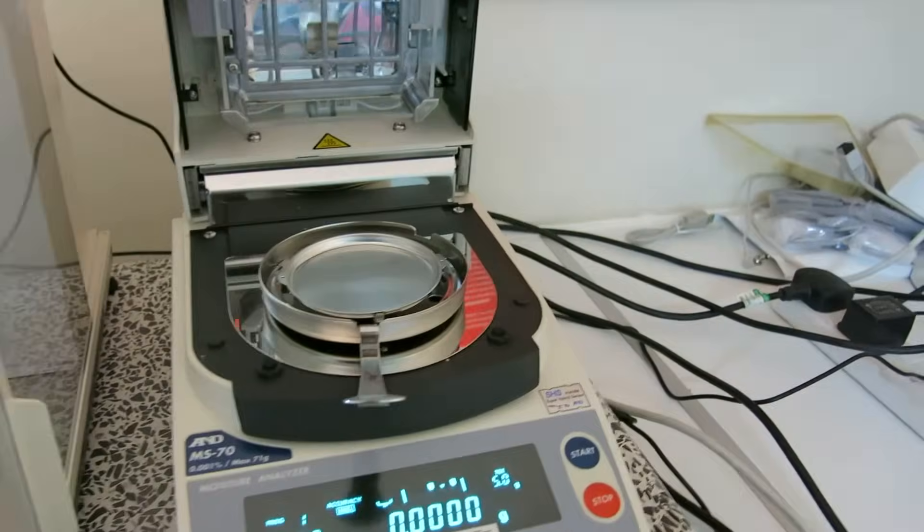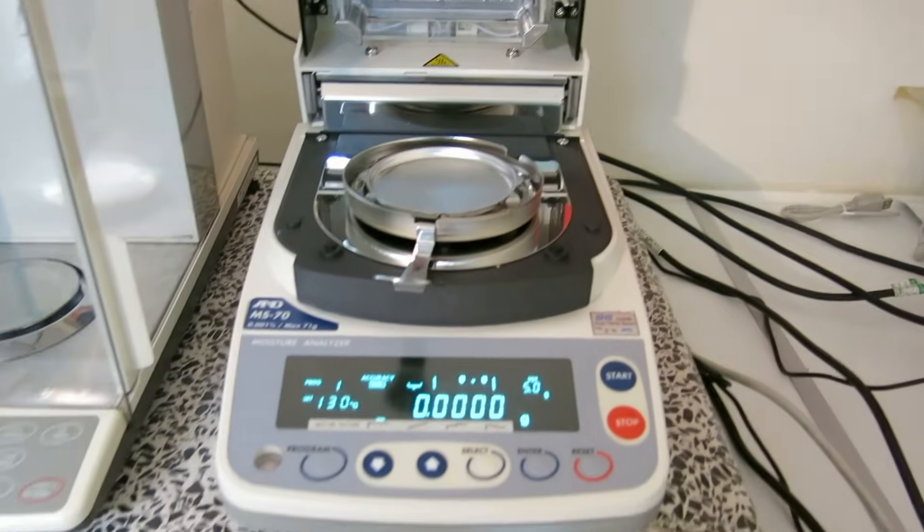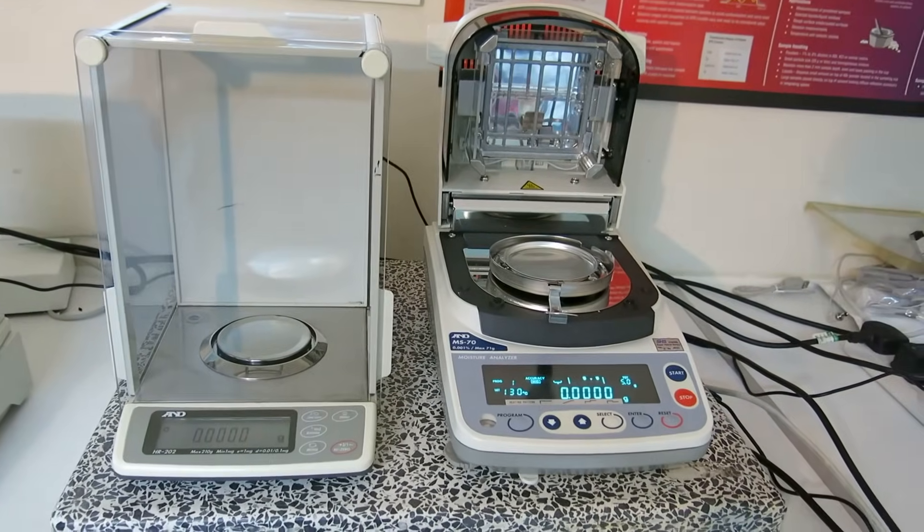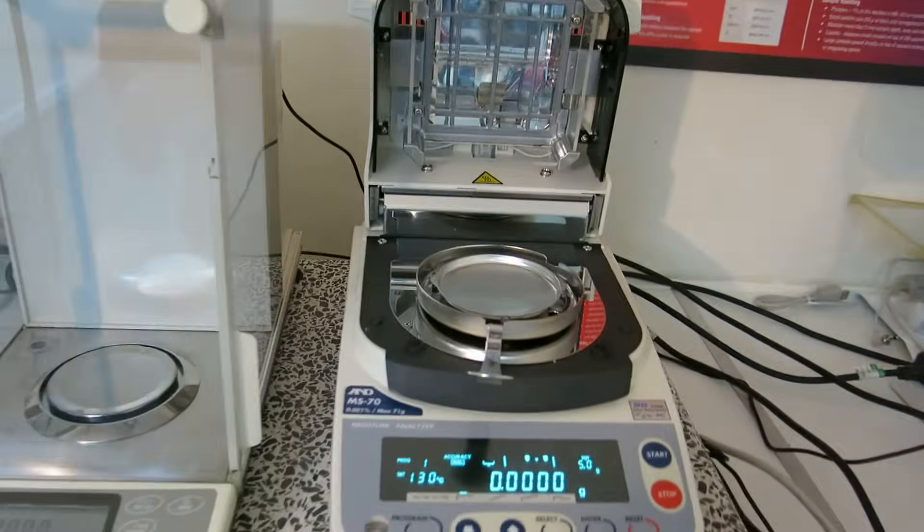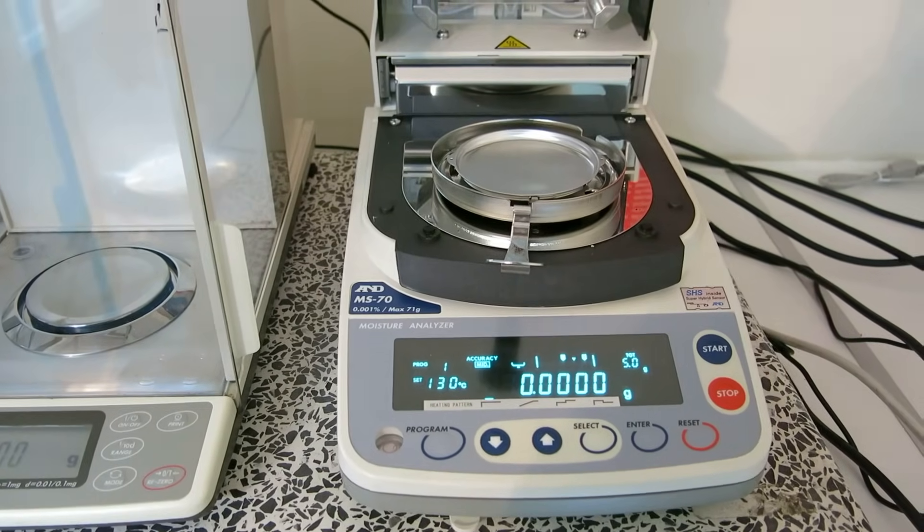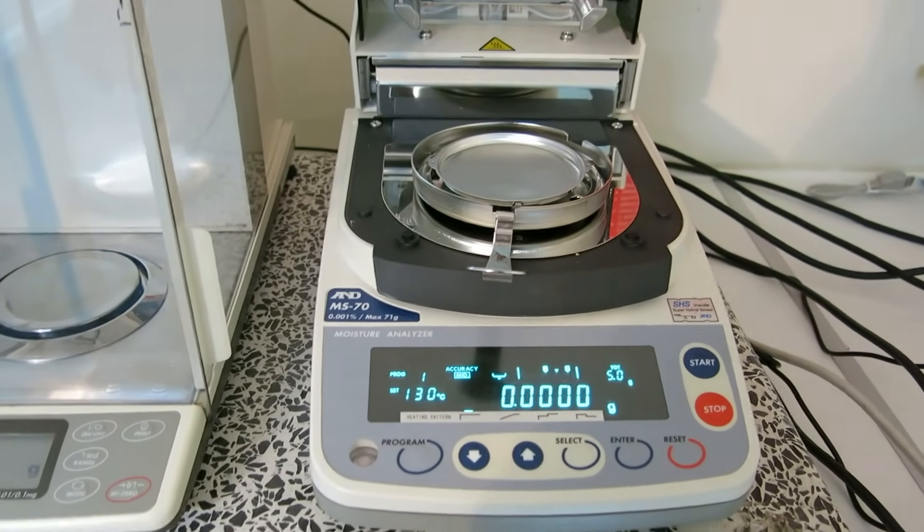And finally we've got the A&D MS70, which is used in low moisture applications. It's 4 decimal place. And it's a really good balance. Particularly plastics, rubbers, where you're looking to determine small levels of moisture. So this will max weigh 71g. It's an MS70 4 decimal place.